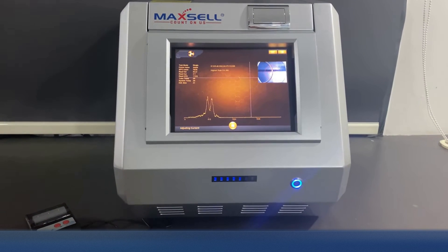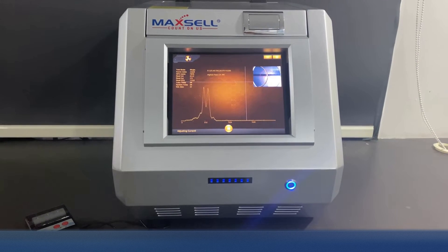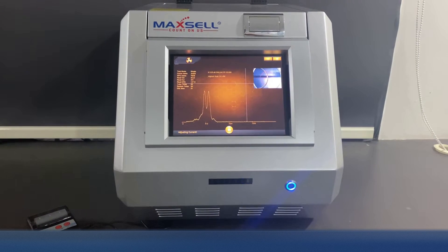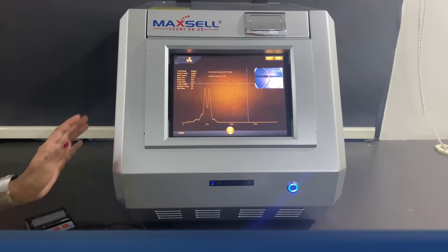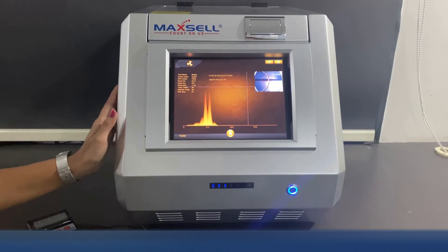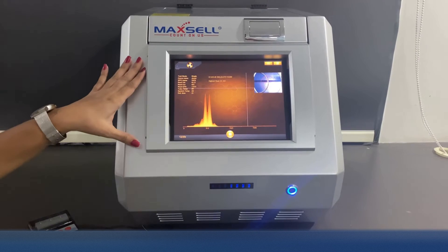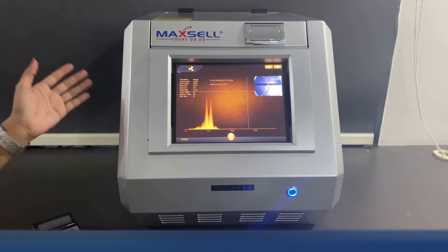Did you think gold testing machines are heavy and bulky? This machine has a compact and sleek design that fits in a small space. It has an anti-rust body that keeps your machine intact for years to come. With an inbuilt PC, you really don't need any other device or laptop to view your sample results.